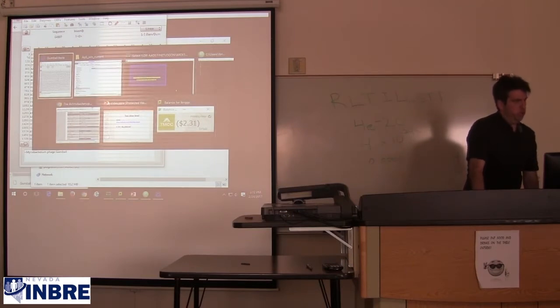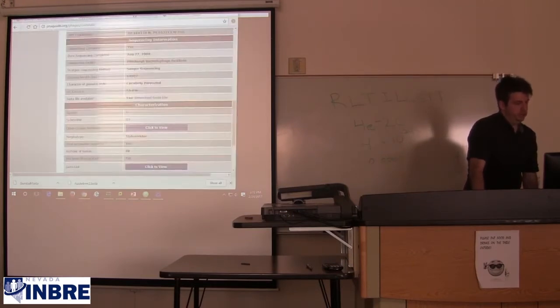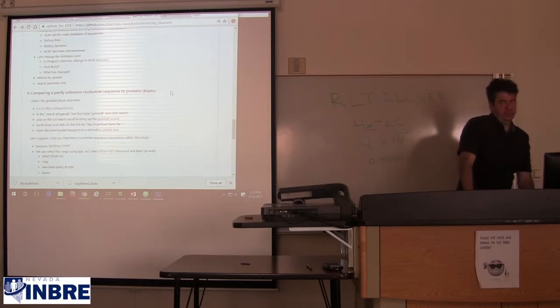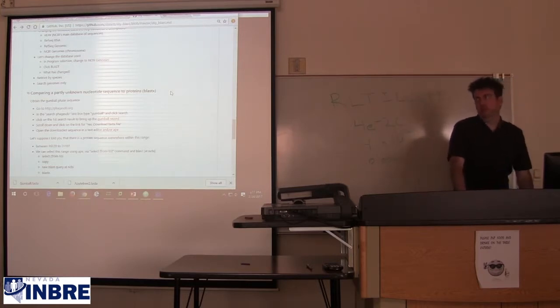According to my instructions in the walkthrough, I'm going to claim that somewhere between the 16,320th letter of the genome and the 21,107th letter is some gene, and I may not have gotten the numbers perfectly right, but it's our job to find out what that gene is and how close to right my numbers were.